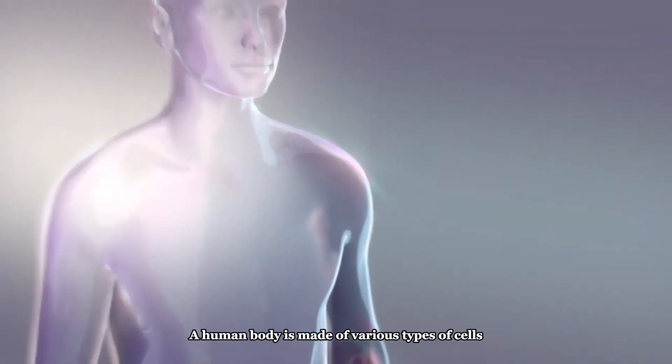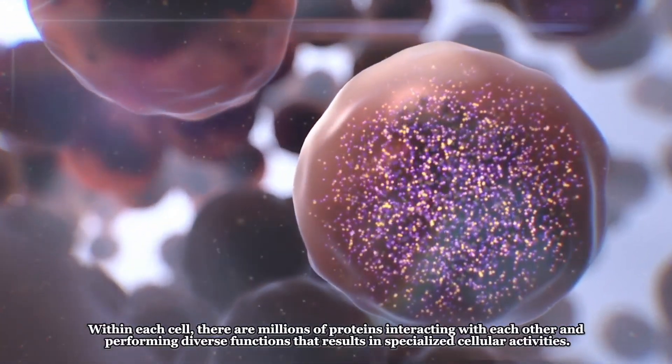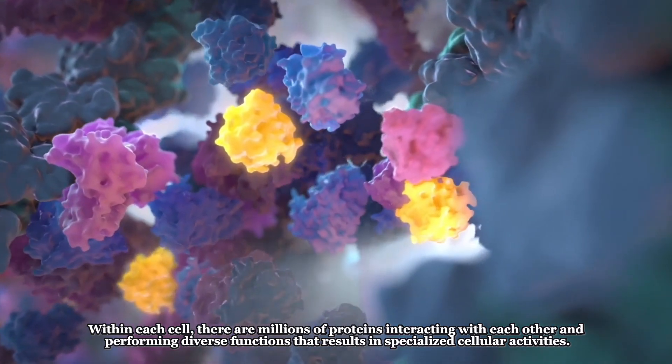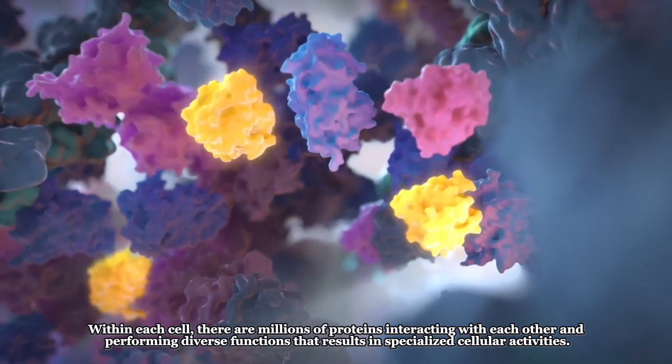A human body is made of various types of cells. Within each cell, there are millions of proteins interacting with each other and performing diverse functions that result in specialized cellular activities.